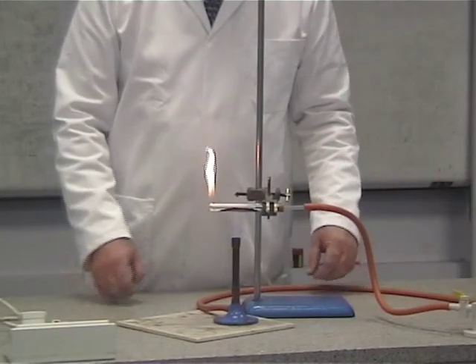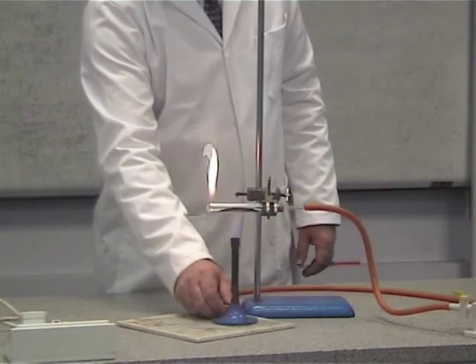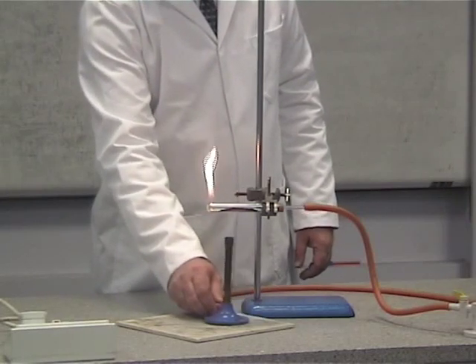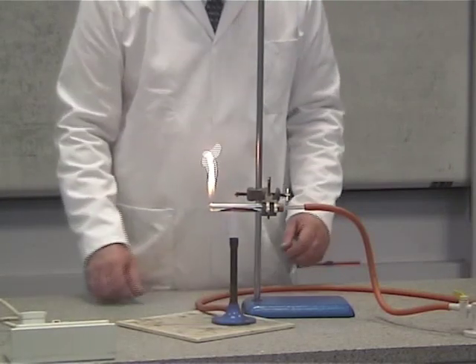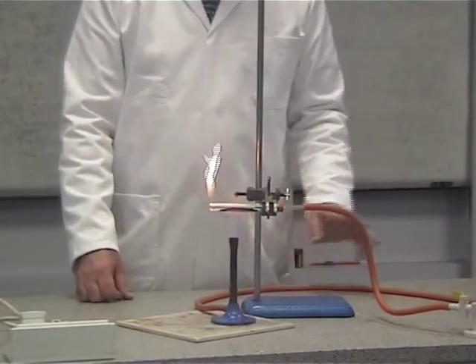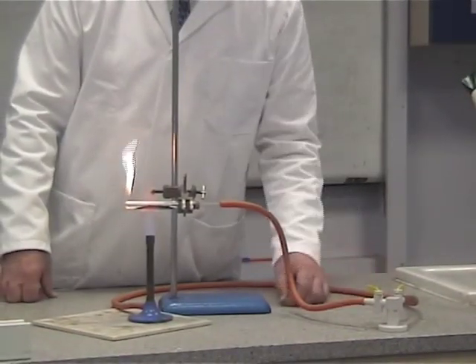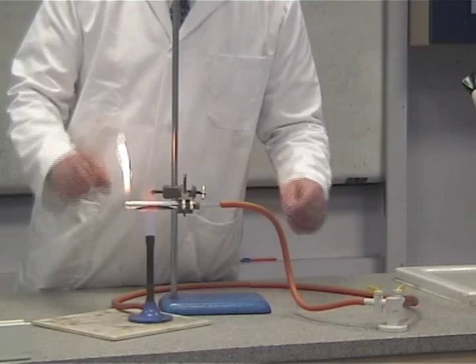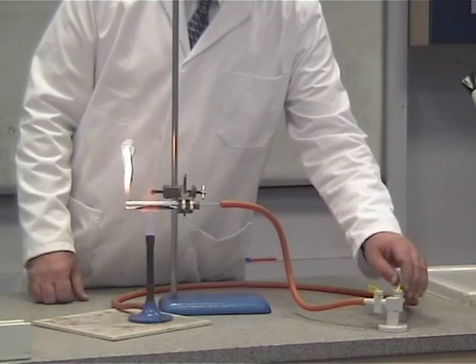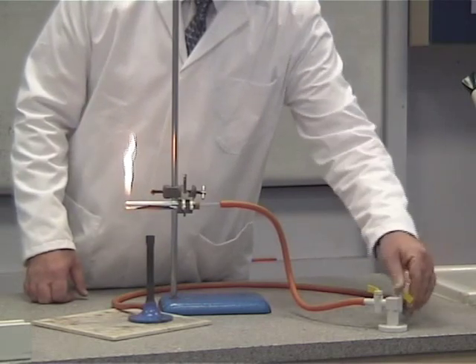Once all the copper oxide has been reduced to copper, and you've got the distinctive pinky red colour all the way along, and you've moved the Bunsen along to check it's all reacted, you need to switch off the Bunsen, and obviously you need to be very careful that you're grabbing the right gas tap, because there is a danger here that you grab the wrong one and you can actually turn that flame going through the tube even higher.